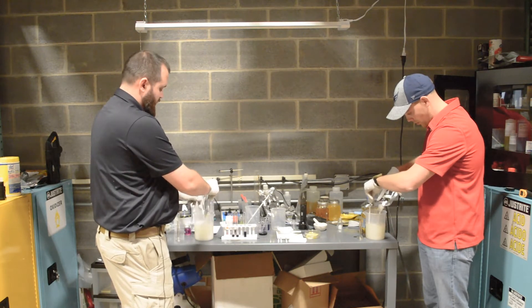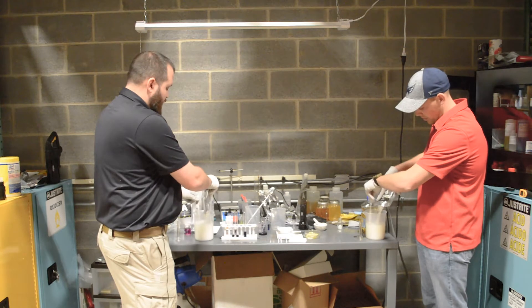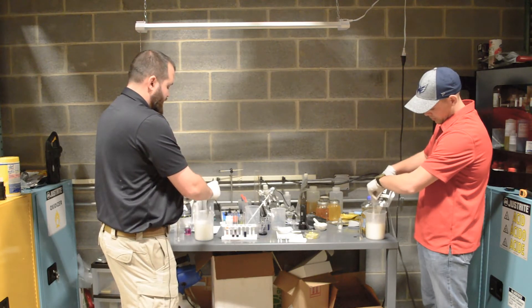These are both batches of Dahlgren that are actually from old stock — over a year old, been sitting on a shelf for over a year — but they are from the same lot number in the same production run.